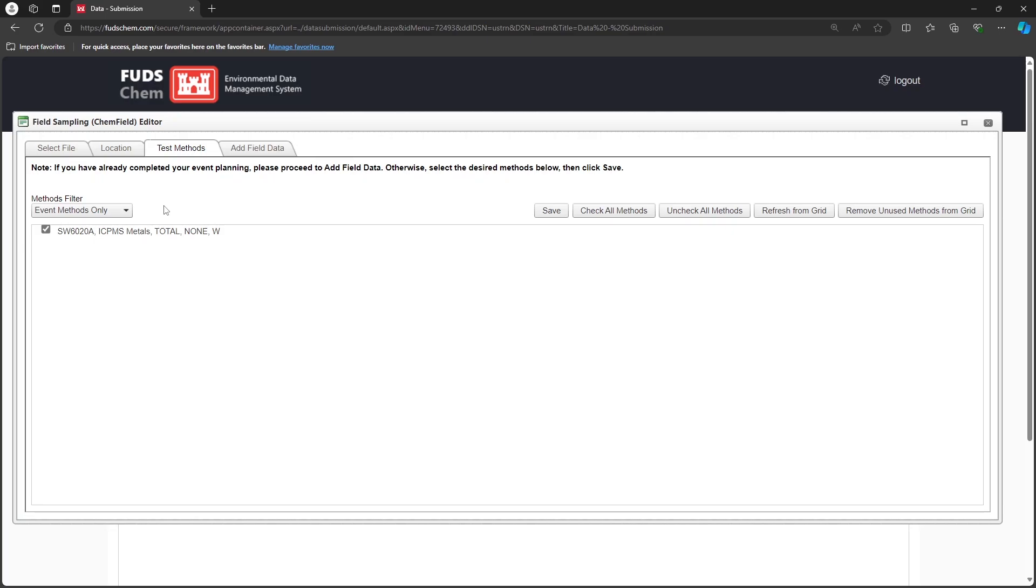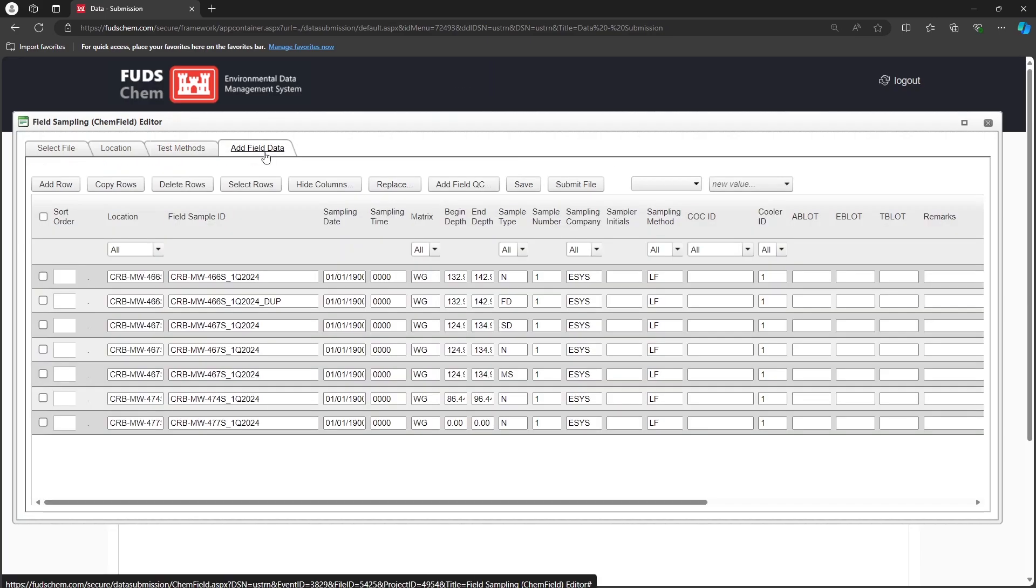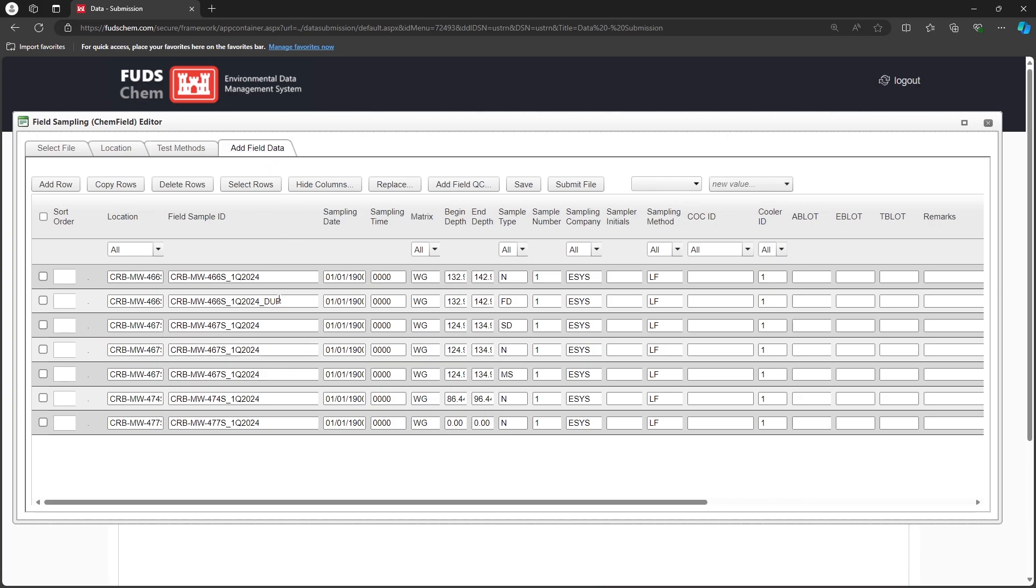Go to the Add Field Data tab. The information that we entered in Event Management automatically shows up here, but there are still a few fields we need to fill out. In particular, the CoC ID.